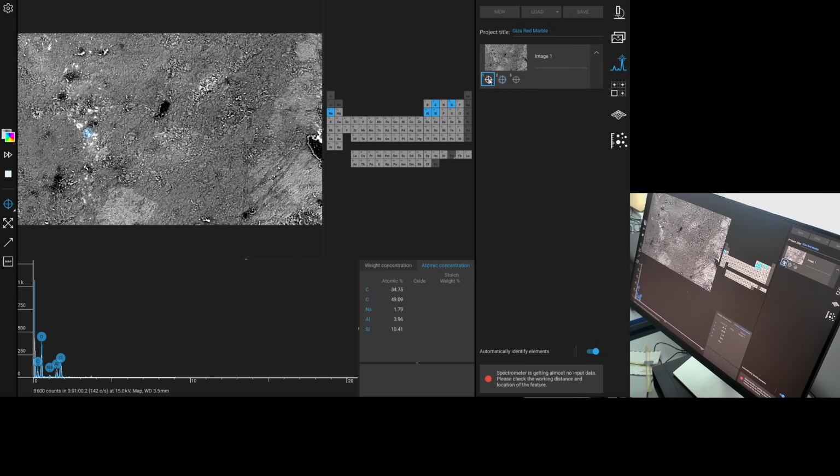So, yeah, not niobium. Not thulium. Low counts because we are so close. Definitely have to work on the edge for this bulk analysis. Now there's this slightly lighter area, slightly lighter mid-grey. So we'll have a look at that.